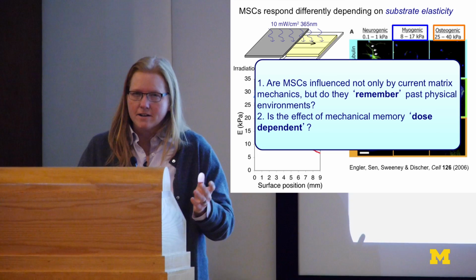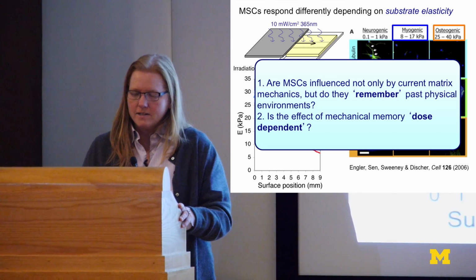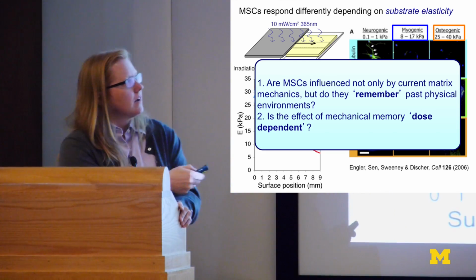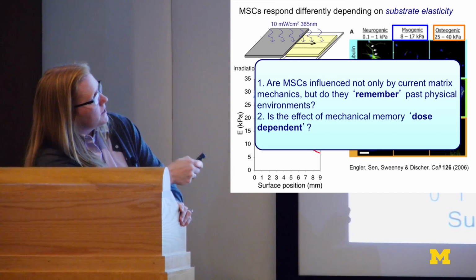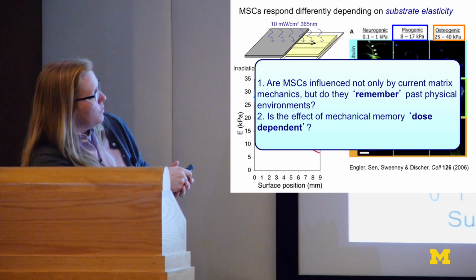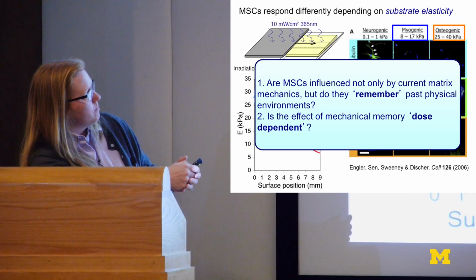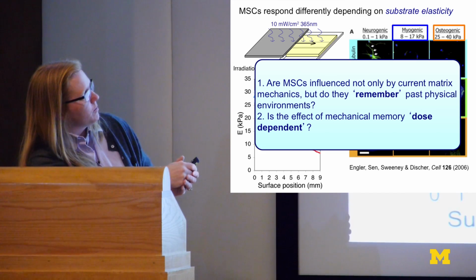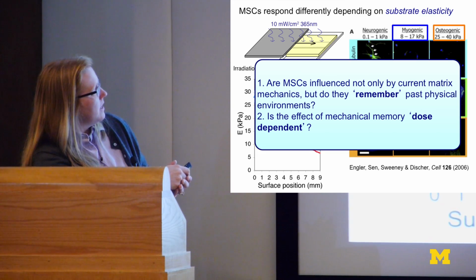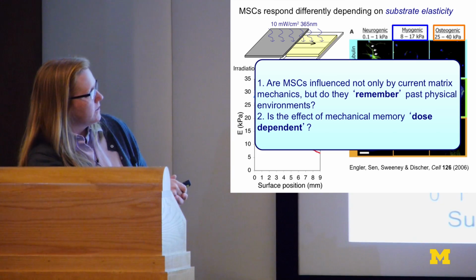And there are many different factors that people are interested in looking at. So what were we interested in? Well, when you make dynamic changes in gels, a couple of things. When we expose for different amounts of time by having a gradient in light exposure, we can make gels that have different modulus depending upon the position along here. If we move a plate across here, creating a gradient in light time exposure. And then we can measure that with a little probe, a nanoindenter, to get the local stiffness.